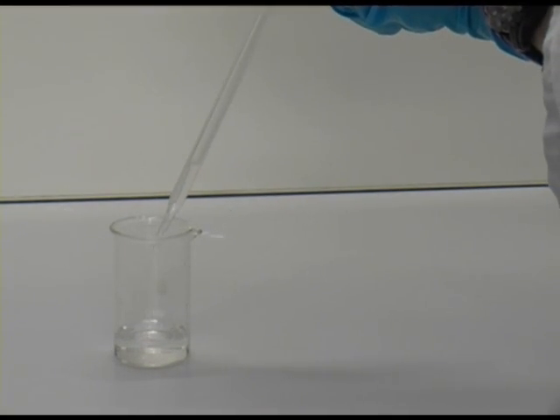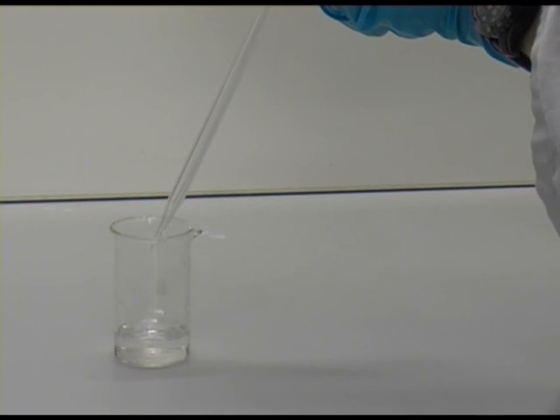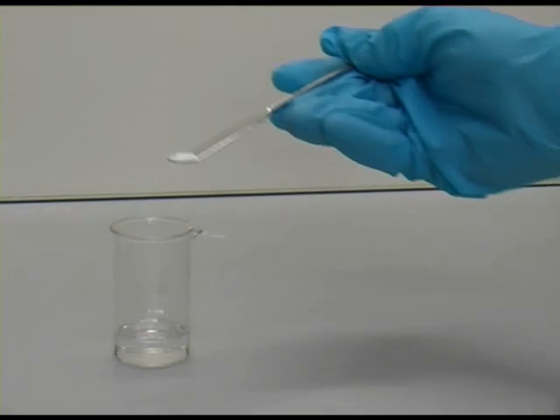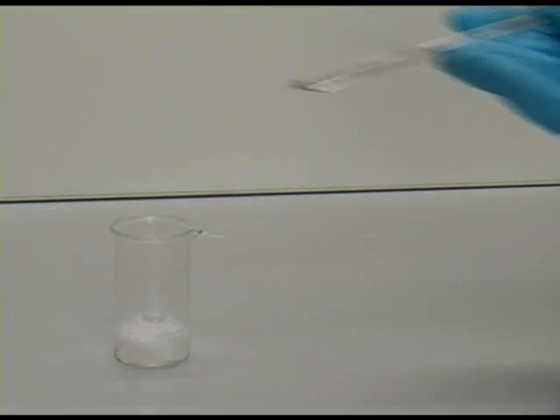If we add a measured amount of acid to this beaker and then add a measured amount of carbonate, you can see the fizzing that happens as the neutralisation takes place, producing carbon dioxide.